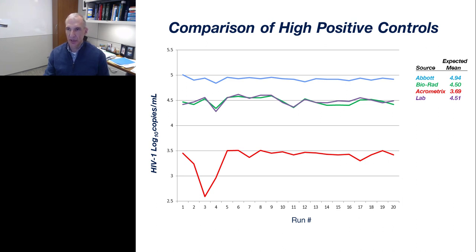But I think, again, what this shows is the value of calculating in your own hands how those controls are performing, and not relying exactly on what the package insert claims are.